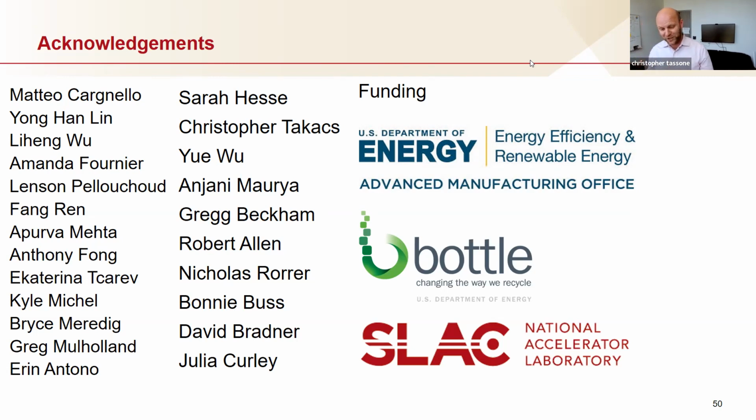But to be totally honest, by the time we had the autonomous data interpretation working, we needed to immediately go to the beamline. So a lot of this we were fixing in real time as we were going about it. Since then, we've used this across many experiments, so I can't really answer your question because we didn't test the invertibility all that much. But I don't think we could define a functional form which relates those 20 parameters to the output parameters. So this is getting fed into a black box.